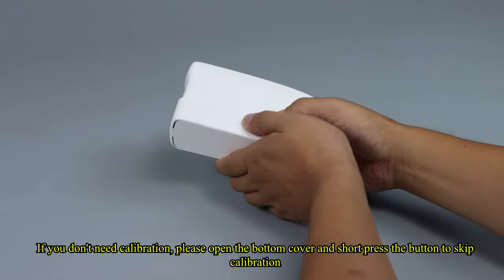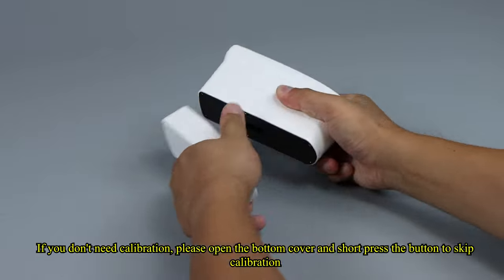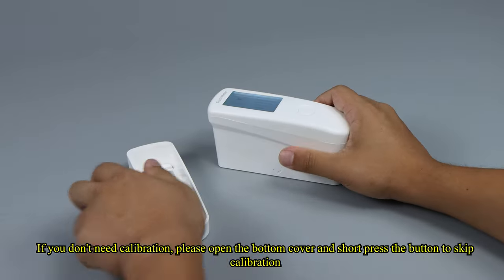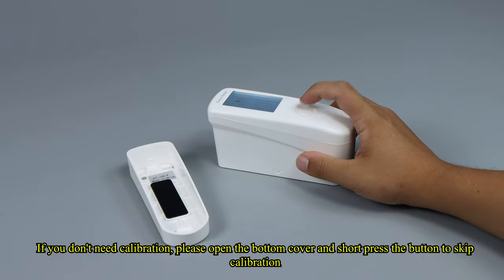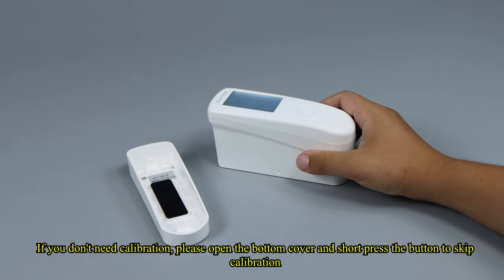If you don't need calibration, please open the bottom cover and short-press the button to skip calibration.